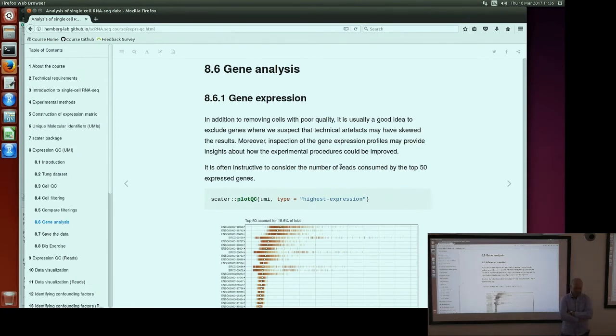To subset any other way, you can also just provide indices, you can provide true, false indices, you can provide cell names to subset. All of those will work. And the cell names would be put into this UMI used part? No, that wouldn't work. I think the question is how we define the filters. We define them using logical vectors, but actually you can define them as you want.